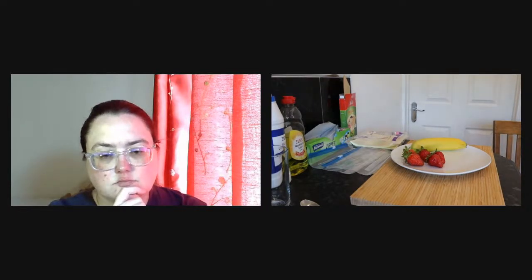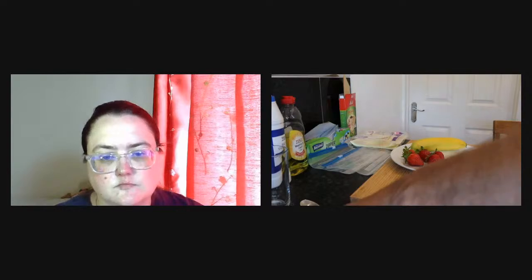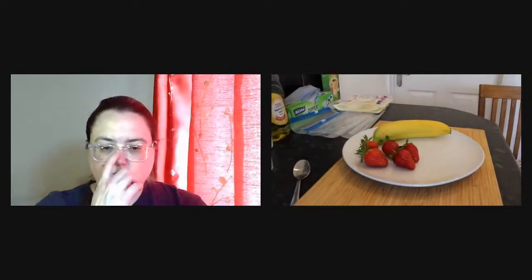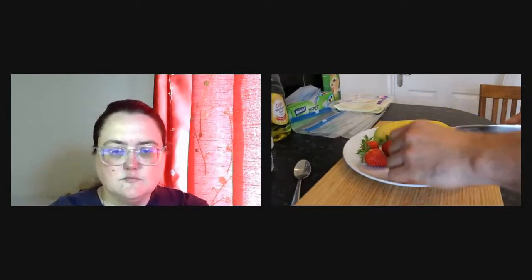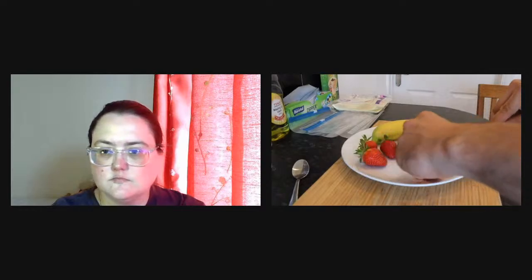Okay, so I think we can start. The first thing we are going to need to do is cut the fruits so we have them ready. Okay, bring this closer. What I want to do is just cut the strawberries in smaller pieces for now.